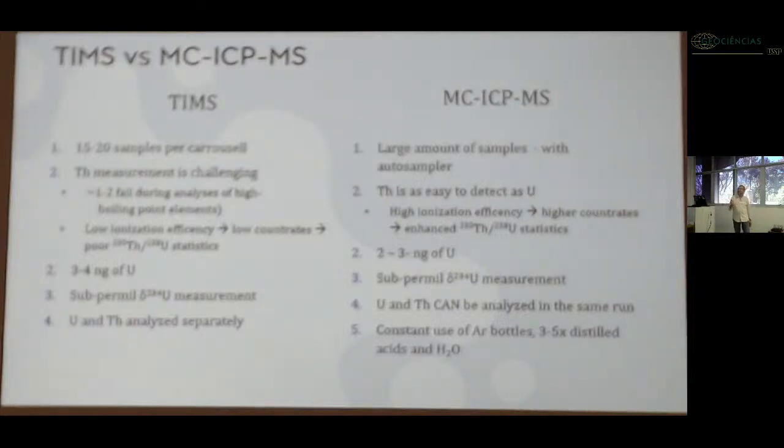And why is that important? Because uranium is volatilized at reasonably low temperatures and thorium at very high temperatures.